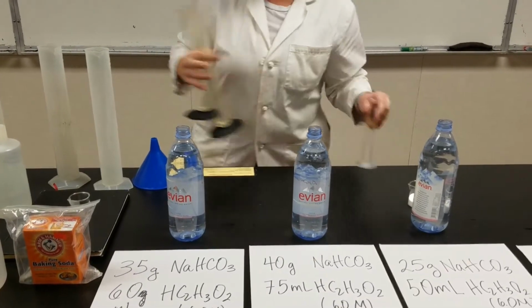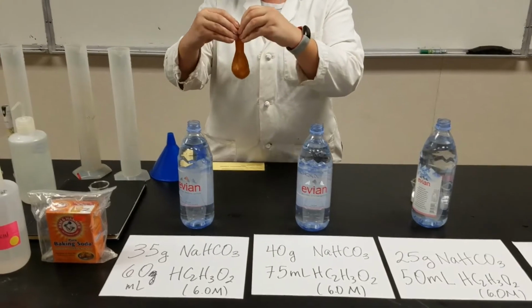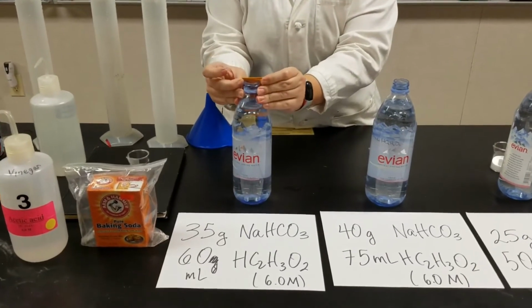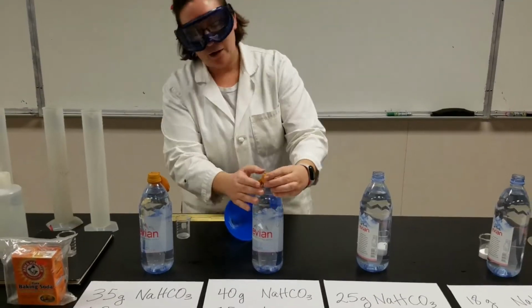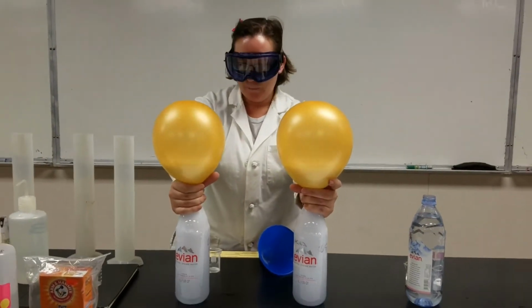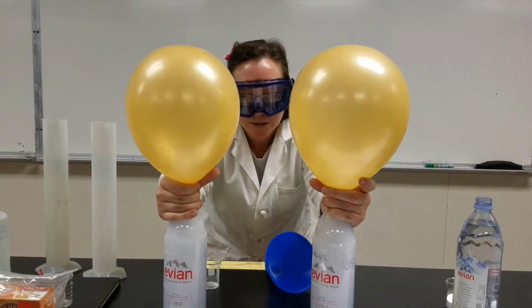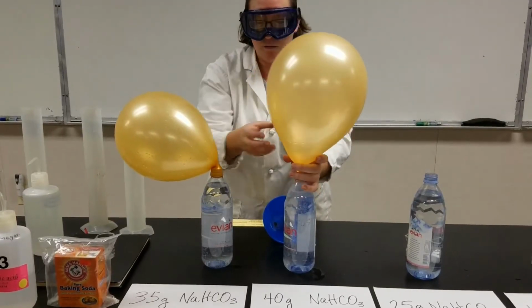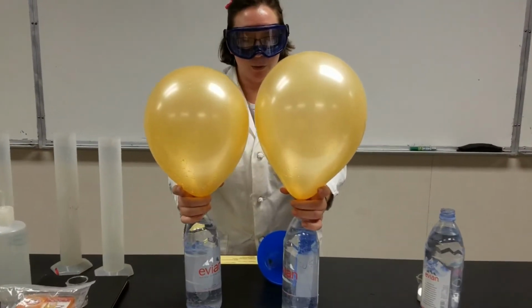Okay, now what we're going to do is initiate the reaction by placing the balloon on top of our bottle. These are not going to behave like helium balloons. They're not going to float on their own. So was your prediction correct?